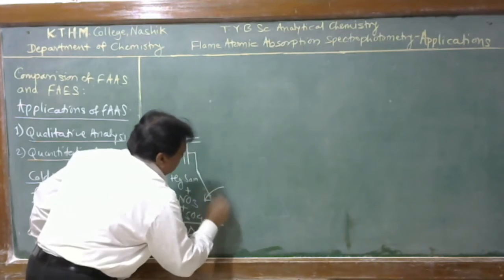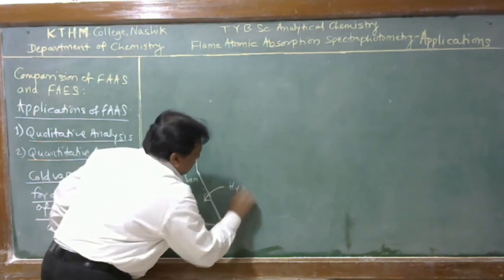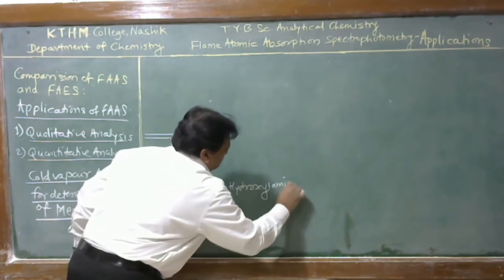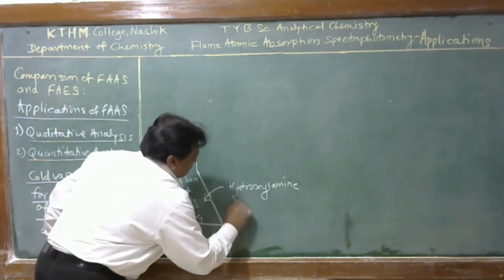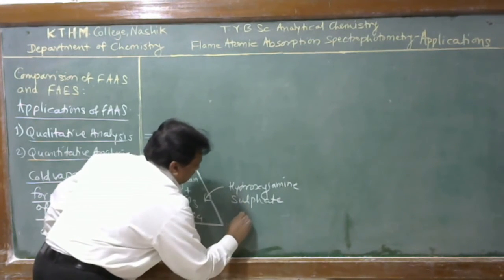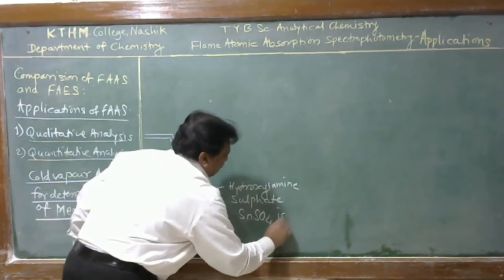Then after that, hydroxylamine sulfate and tin second sulfate, that is SnSO4, is added.